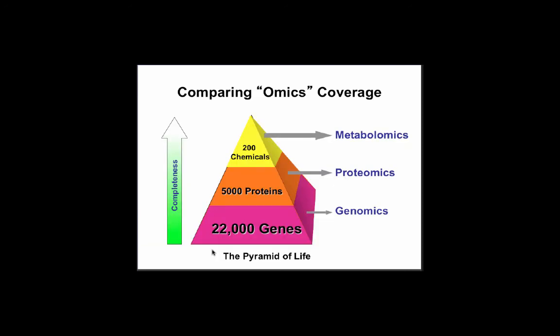So one of the challenges with metabolomics is that even with the technologies of NMR, mass spec, GC-MS, and chromatography, we don't often identify much more than about 200 compounds. Now, if you're doing untargeted metabolomics, everyone will claim that they've got 5,000 features or 10,000 features or 20,000 features. But in the end, they're usually lucky to identify 200 or 300 of those features. And that's probably on the high side. Many people are quite content to just talk about 10 or 20 metabolites.